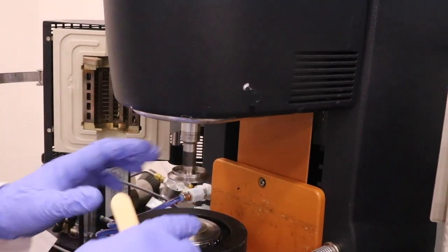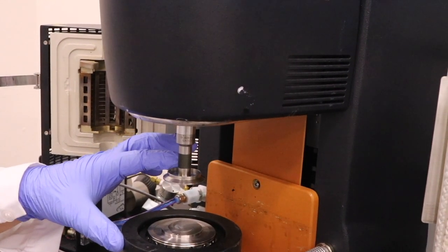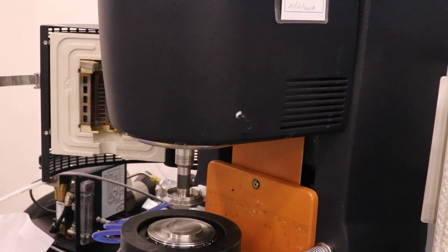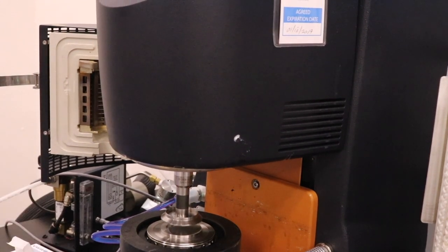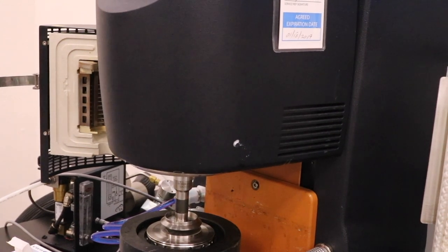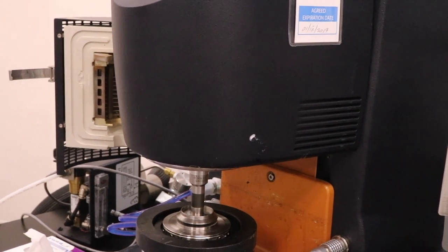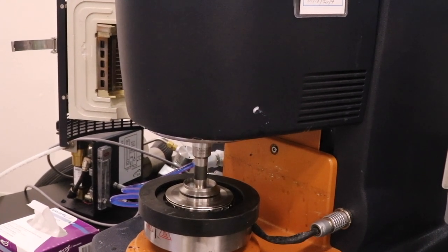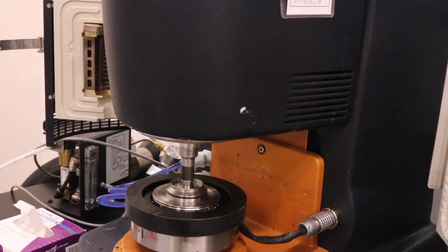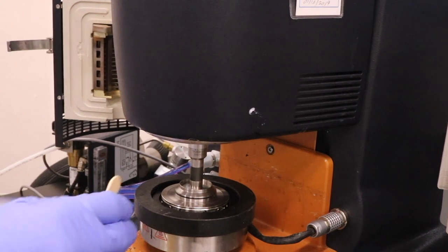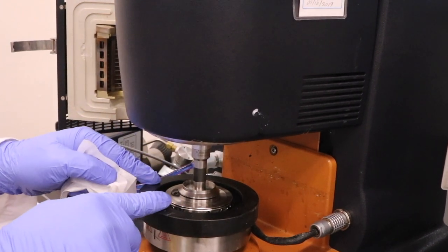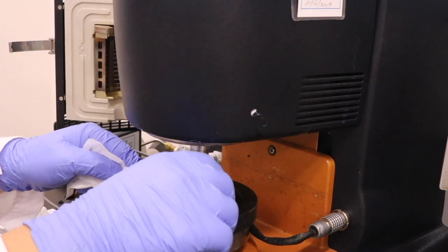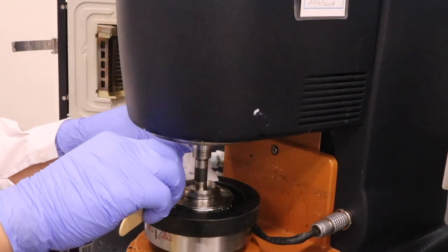And then we will lower this top plate to a 100 micrometer gap. And once the gap is totally filled with the material and reaches 100 micrometer gap, we will trim off the excess material so that they won't affect the testing result.